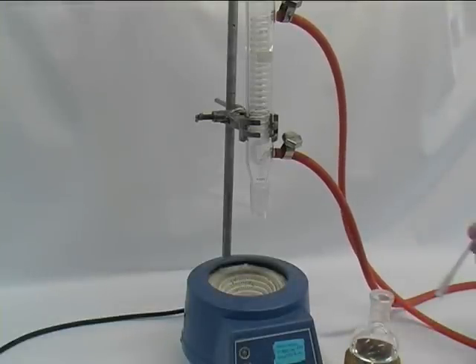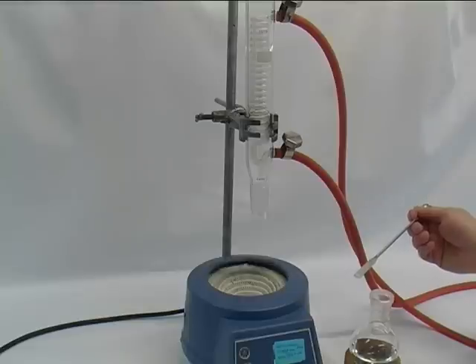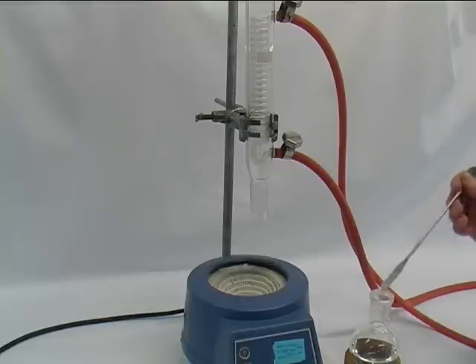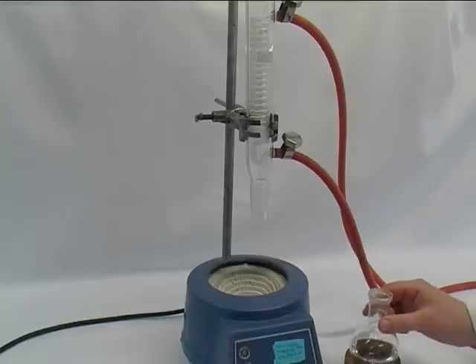The next part of the setup is to put in some anti-bumping granules into the liquid in the round bottom flask. This helps to even out the refluxing a little bit.